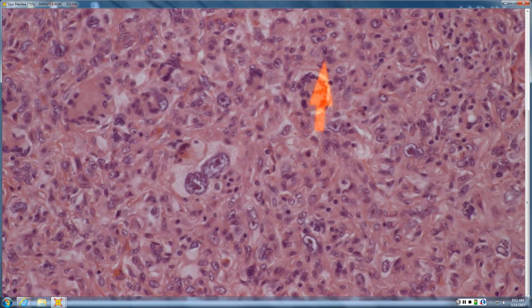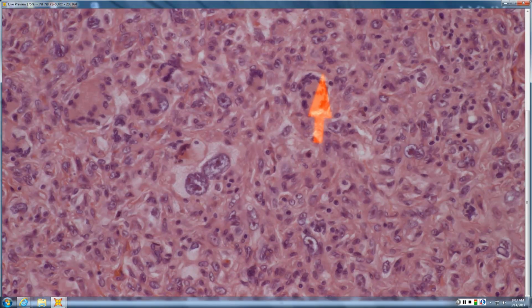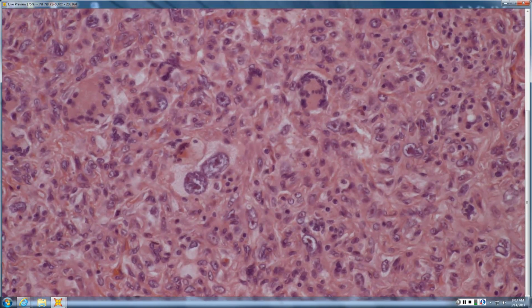And peripheral to the wreath, is it just normal cytoplasm, or is it clear and bubbly? Clear and bubbly. So what would be a lipidized, ringed siderophage, or I don't see hemosiderin, but a Touton giant cell, right? So Touton giant cells. So it's something with Touton giant cells, no hemosiderin that we're seeing. Touton giant cells and fibrous tumors, any particular ones?